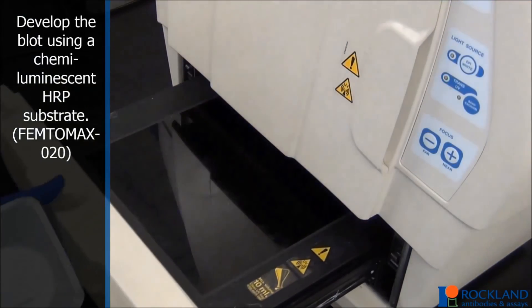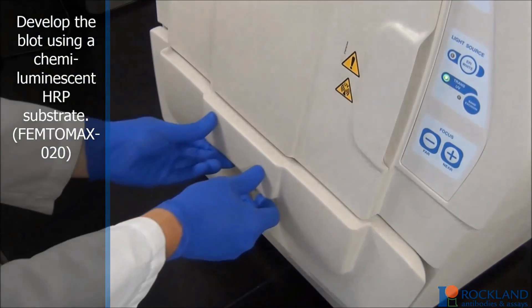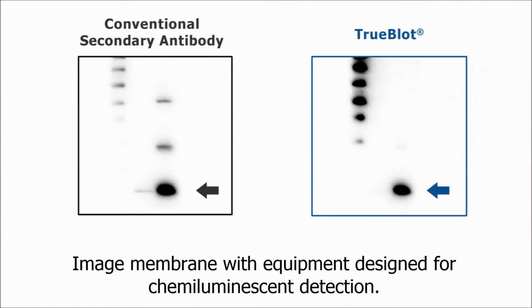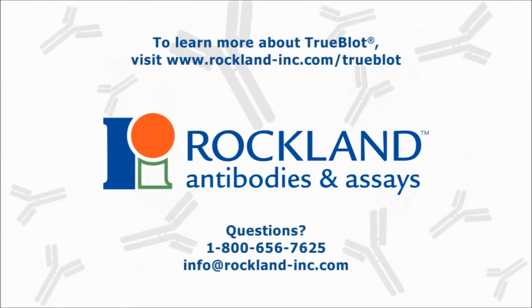Develop the blot using a chemiluminescent HRP substrate. We recommend Rockland Femtomax. Image the membrane with equipment designed for chemiluminescent detection. TruBlot technology helps researchers produce high-quality results with unparalleled clarity suitable for reproduction. Generate publication quality data with TruBlot today. To learn more about TruBlot, visit www.rockland-inc.com/TruBlot.